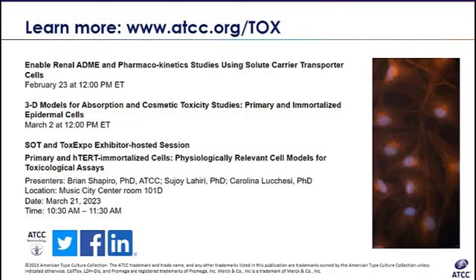Okay. So, yeah, the OECD guideline is basically internationally recommended guidelines for different toxicity. That could be ocular toxicity, dermal toxicity, and so on and so forth. So it's basically the industrial guideline. So is the question directed at whether the model is available at ATCC or the model is available elsewhere in the world? Let's go with, is the model available with ATCC?